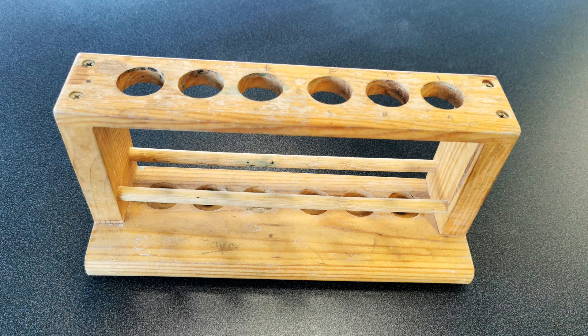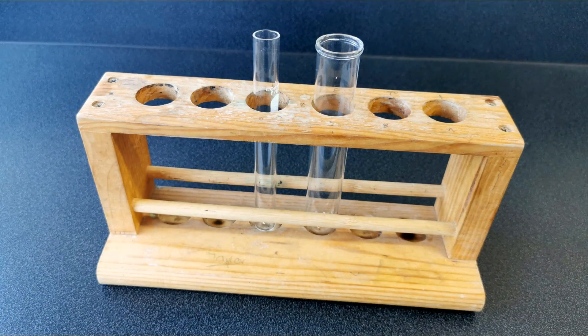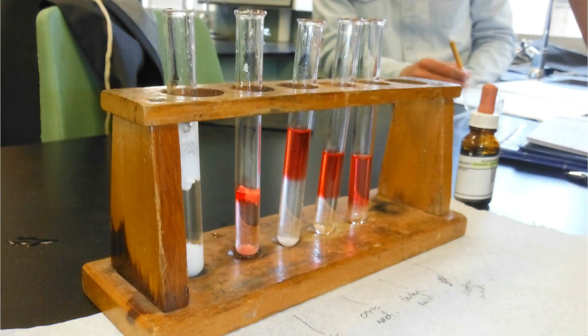Now you can't just keep holding a test tube while you're doing your experiment, so we have a test tube rack. Your test tubes literally just stand up vertically so that you can go on with doing other things related to your experiment and use your hands for other things.